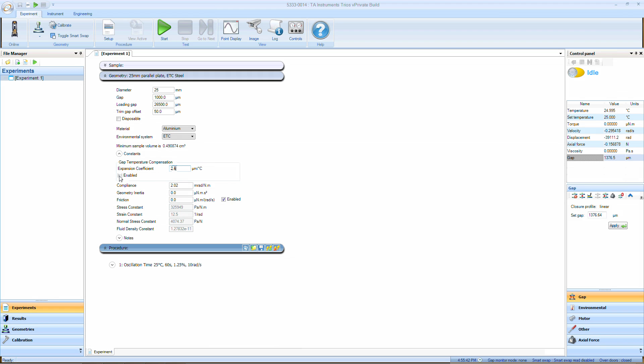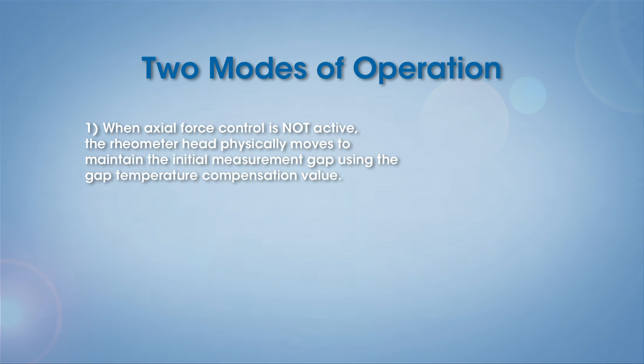When enabled, there are two modes of operation depending on the set axial force control. When axial force control is not active, the rheometer head physically moves to maintain the initial measurement gap using the gap temperature compensation value.